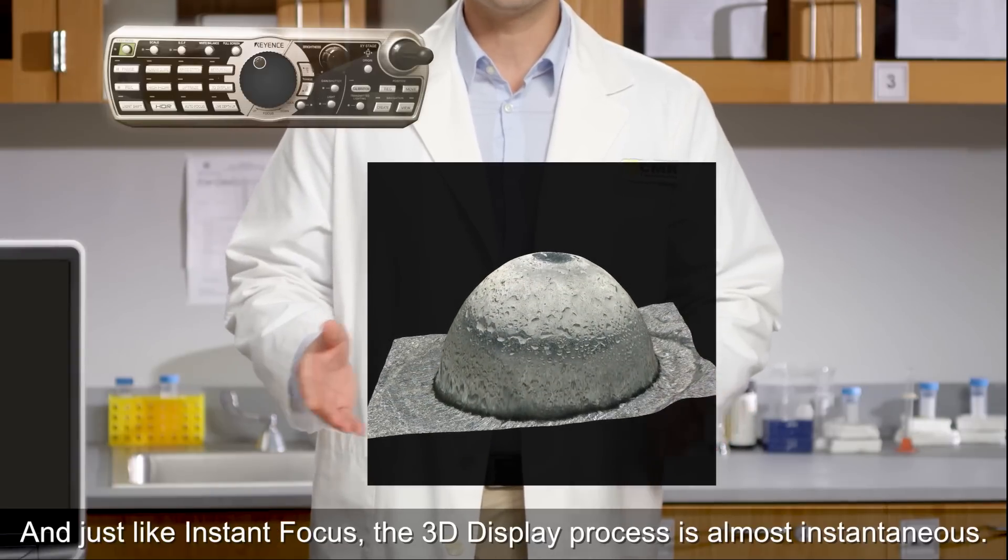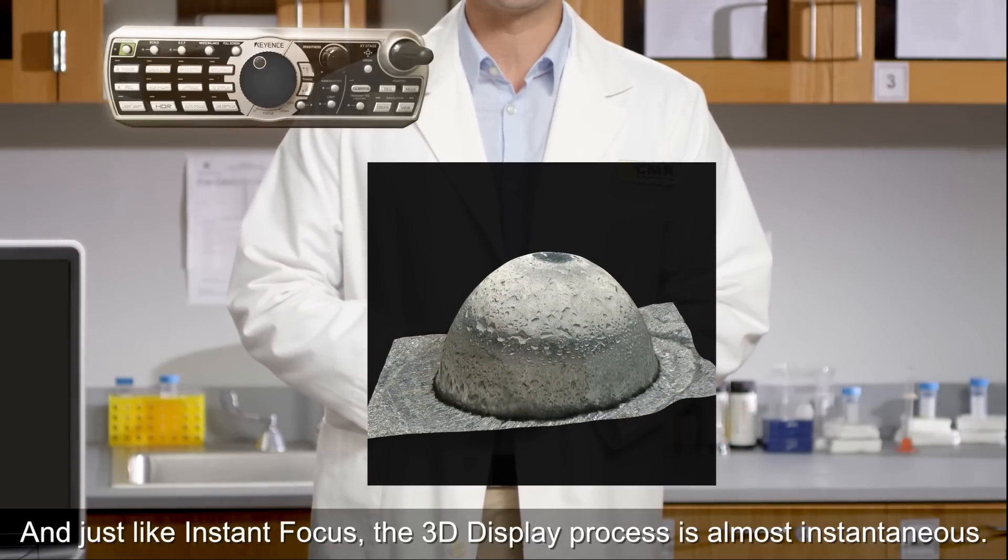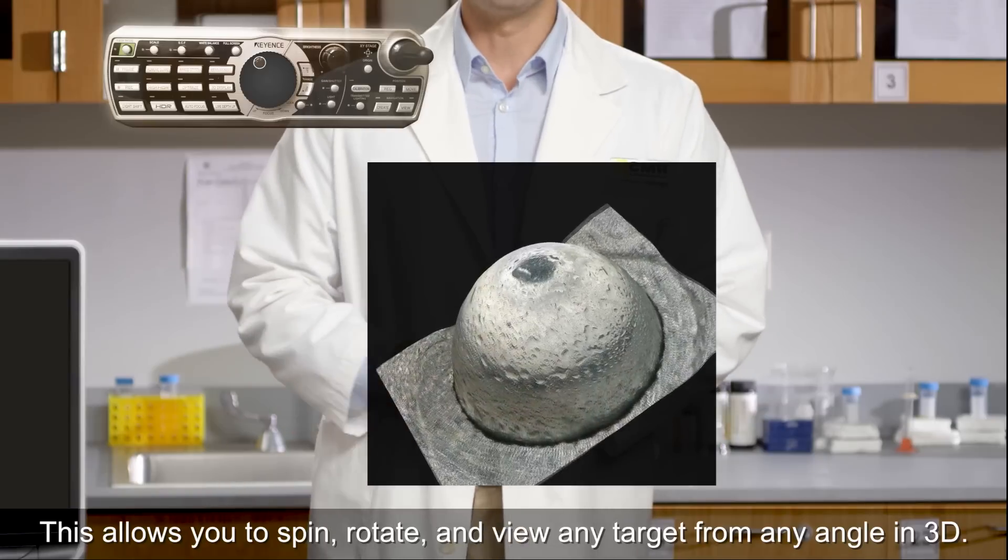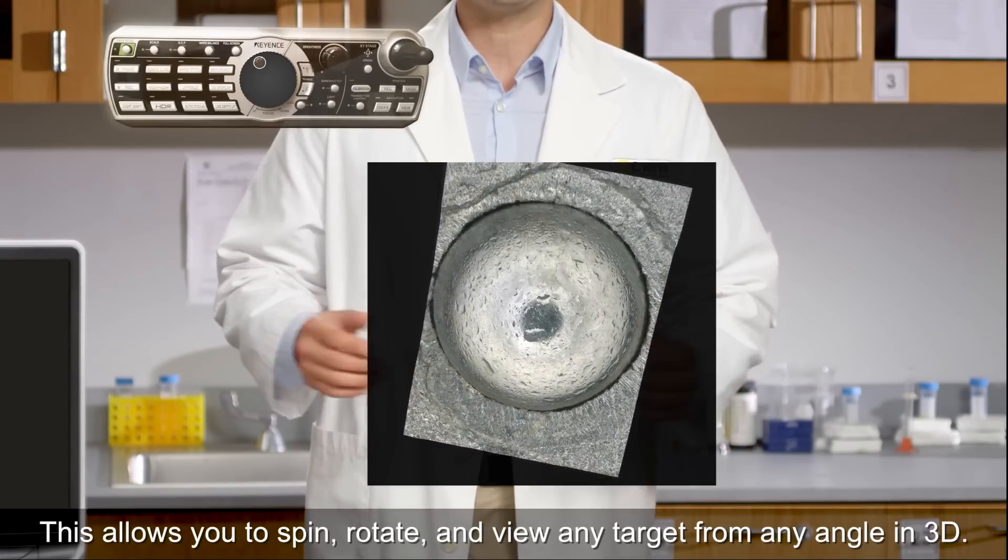And just like instant focus, the 3D display process is almost instantaneous. This allows you to spin, rotate, and view any target from any angle in 3D.